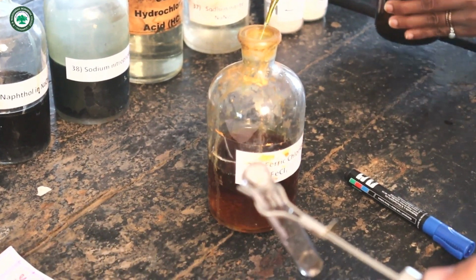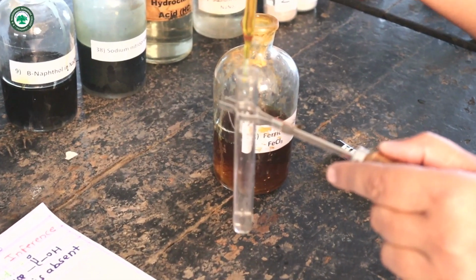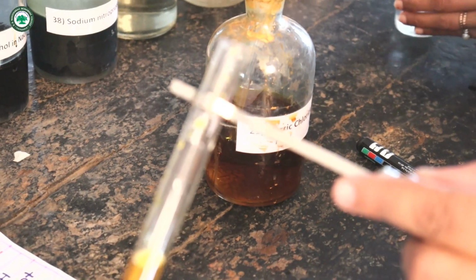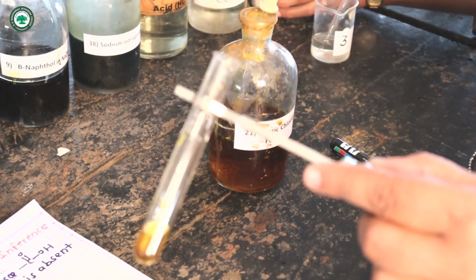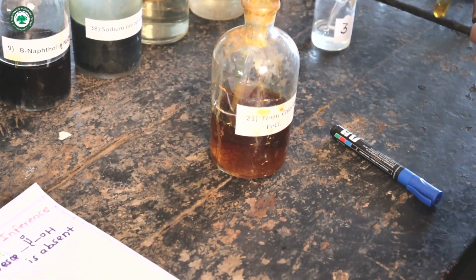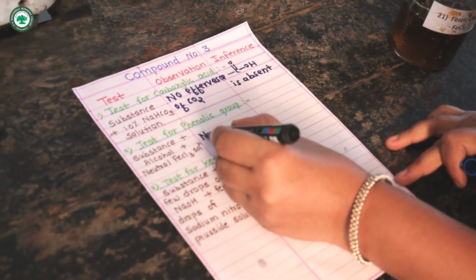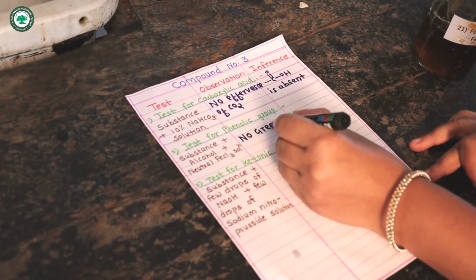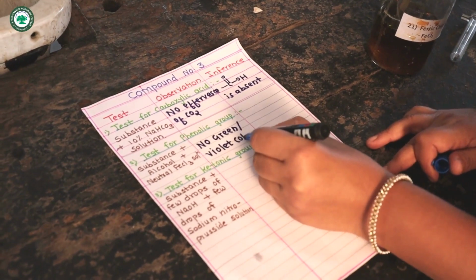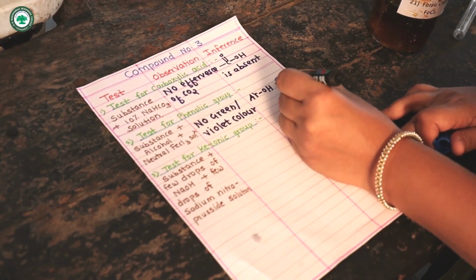If there is green, blue or violet color, then and only then phenolic group is present. No green, no violet color is observed, therefore phenolic group is absent. No green or violet color. Phenolic group is absent.